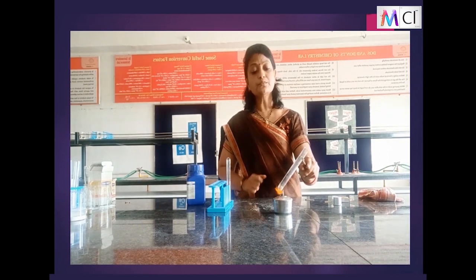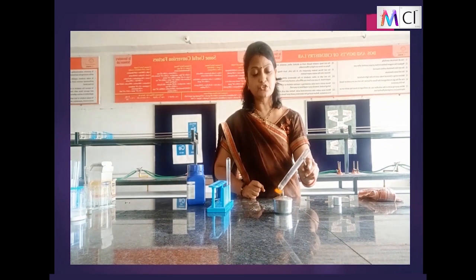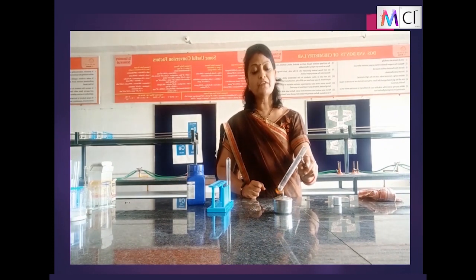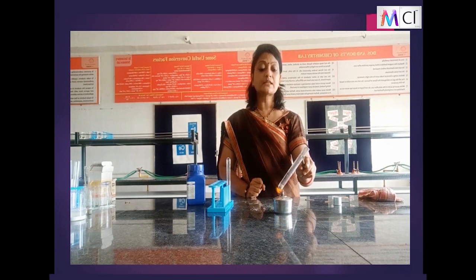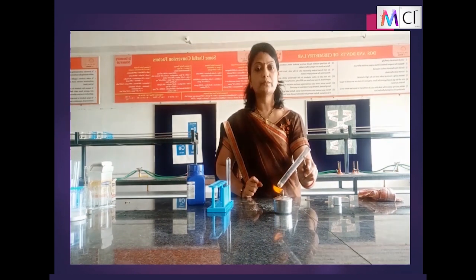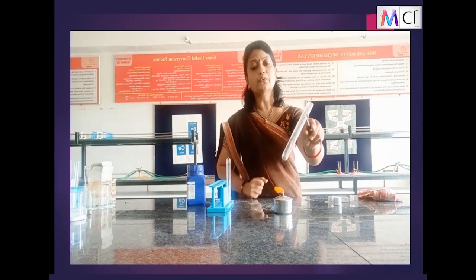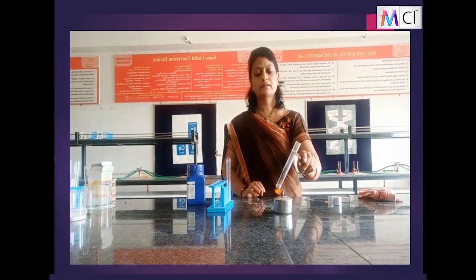Yes, you can even observe the water droplets which are settled on the inner walls of the test tube. From where have these water droplets come? That is the water of crystallization which was present in it, isn't it? 7 water molecules. Now when I heat it, these water molecules are evaporating and you can observe it. They are settled on the cooler part of the test tube. Here in the inner part you can observe there are minute water droplets. We will continue heating.